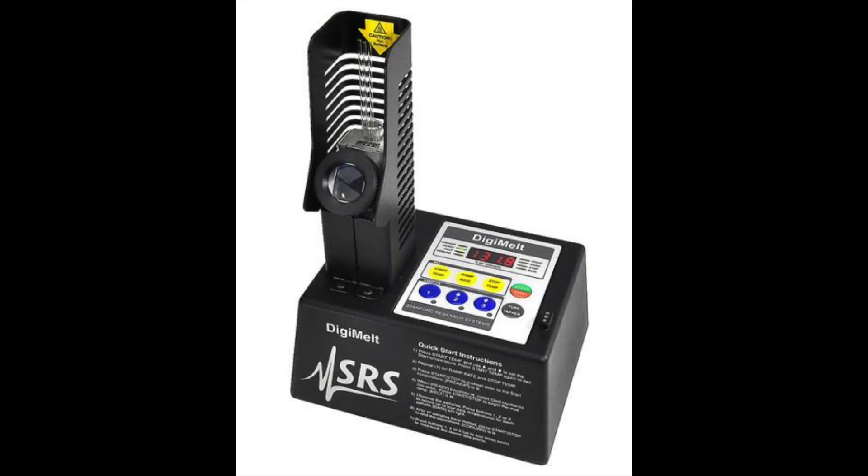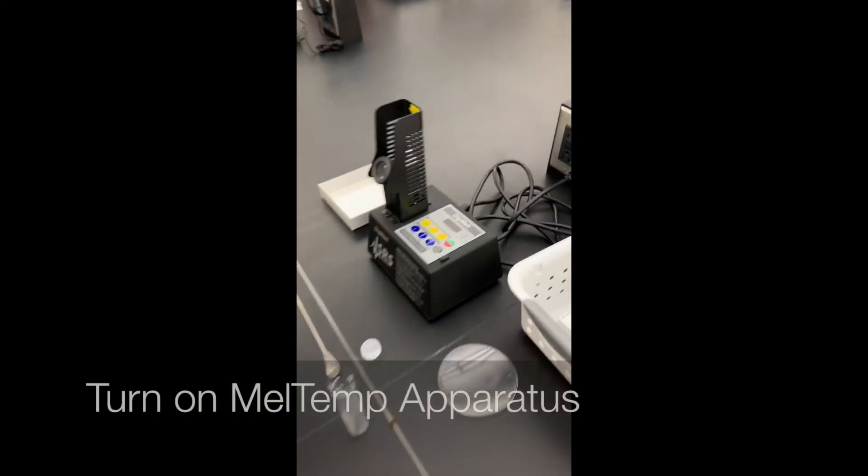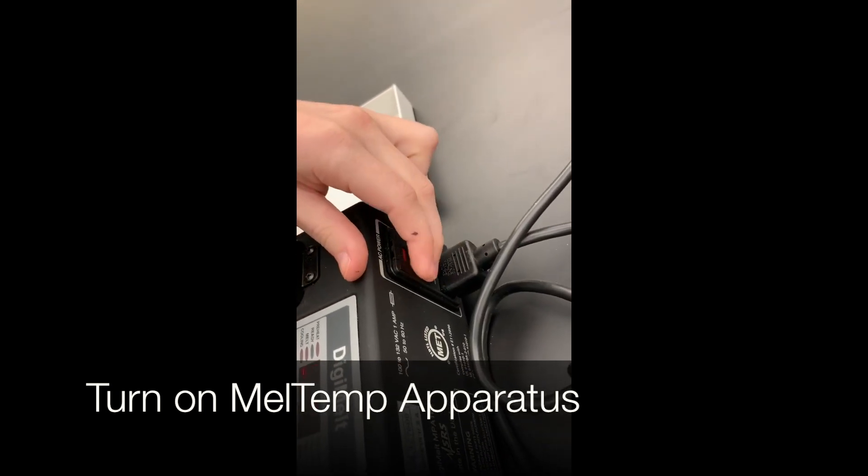To obtain a melting point range of products in the organic chemistry lab, we use a melt temp apparatus. To begin, you will turn on the melt temp apparatus using the on-off button.